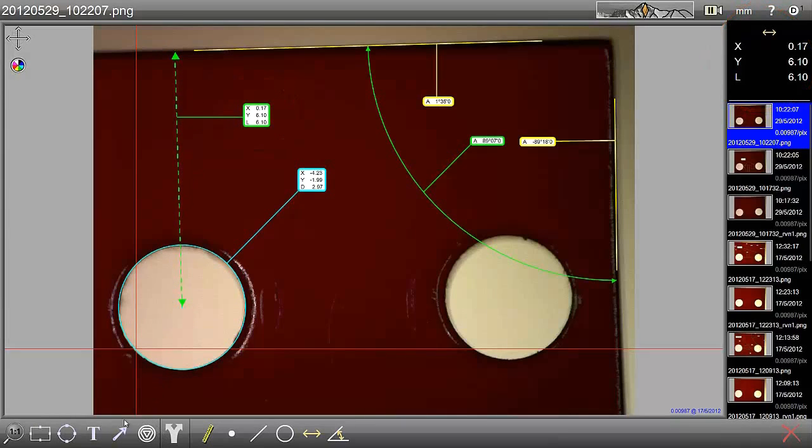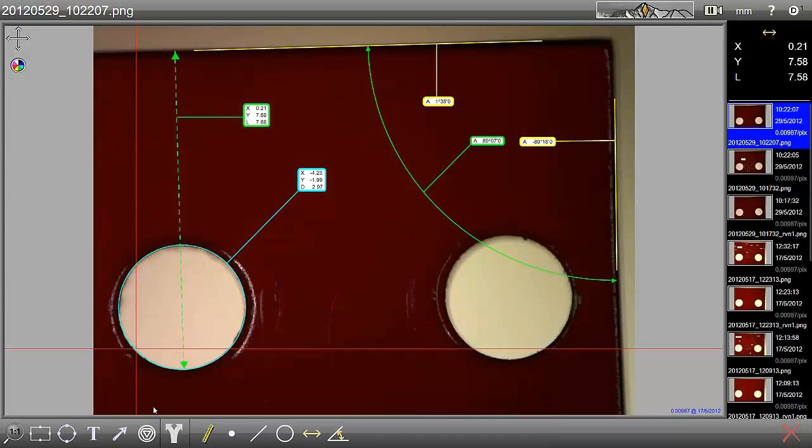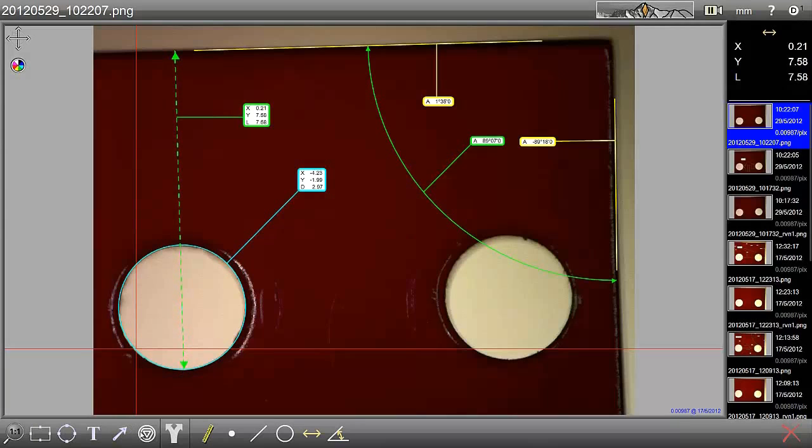At the moment, you will see this is the center of the circle to the top line. If you click on this icon on the bottom called the change type key, you can see we can have the shortest distance or make it the longest distance. In this case, we are going to select the shortest distance.